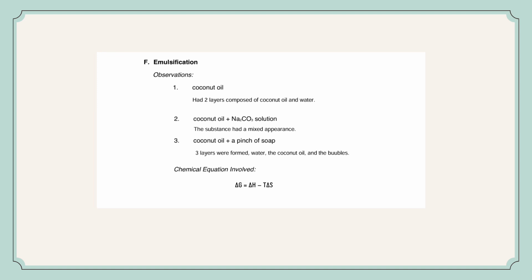For the emulsification test, coconut oil, when mixed with water, formed 2 layers. When coconut oil was mixed in sodium carbonate, it had a mixed appearance. And lastly, when coconut oil was added with a pinch of soap, 3 layers were formed: water, the coconut oil, and the bubbles.